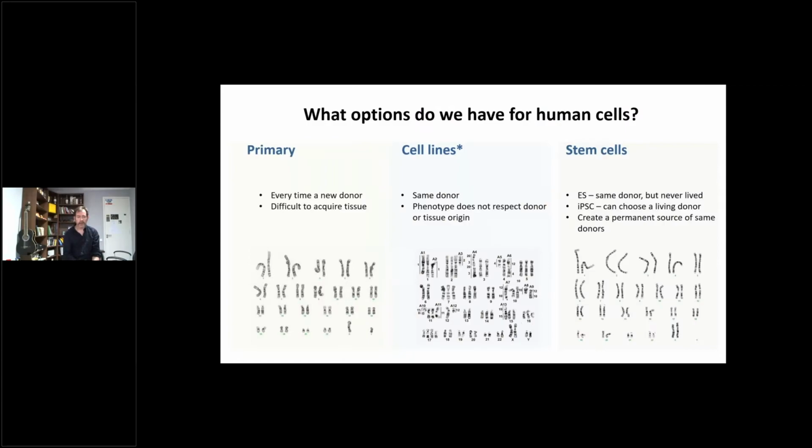So how do we investigate that in our lab? So we have 3 different ways of doing it. So with primary cells, so they're cells that come from, remember, I'm only talking about human cells. We don't grow animal cells. So we can get people who had a car accident, or usually we get our kidney cells from renal carcinomas, because they're usually overcautious and take out healthy tissue as well. But that's actually becoming problematic, because the surgeries are getting better, and they can be more exact where they cut.